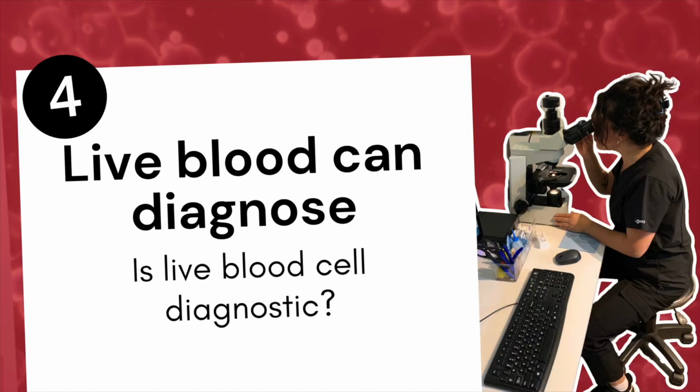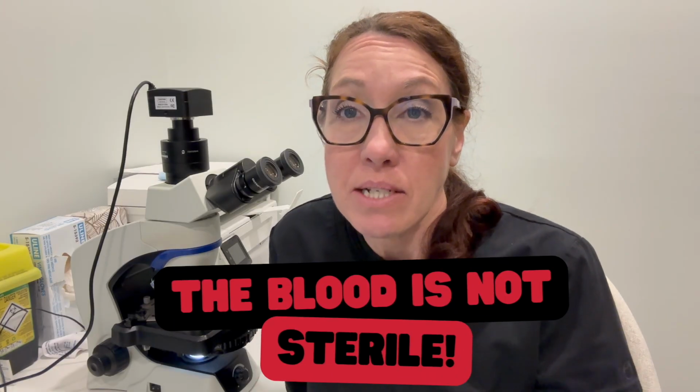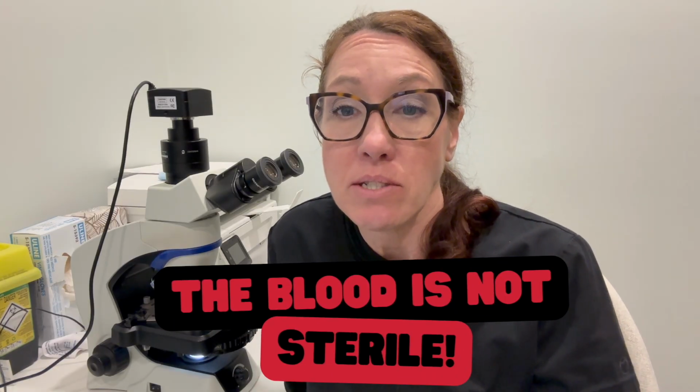Number 4, live blood cell can diagnose illness. Live blood cell is not diagnostic. It will give you guidance and help you put the puzzle pieces together to go do additional testing. This is a great tool for your doctors to take a look at and see what's happening in the blood in the manner of a non-sterile sample. And that's why we have over 150 doctors that refer to my company, who know that the blood is not sterile and they're looking at a non-sterile sample.